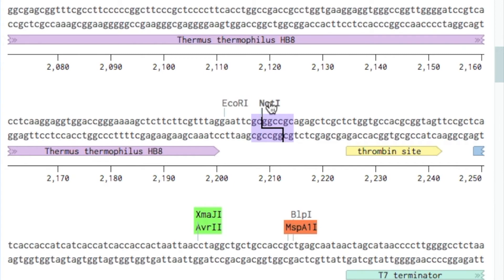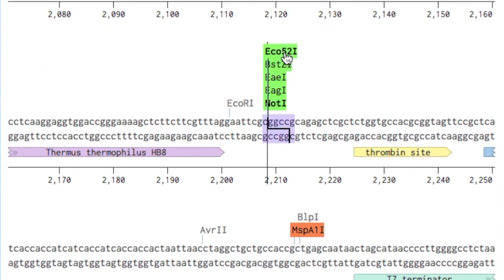You may notice the sudden appearance of other enzymes highlighted in green. These are enzymes that produce the same four base pair overhang as NOT1, but have different recognition sequences.